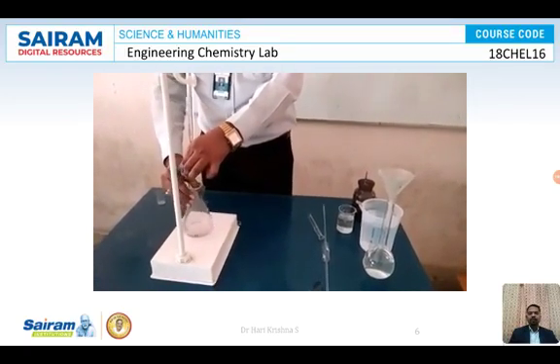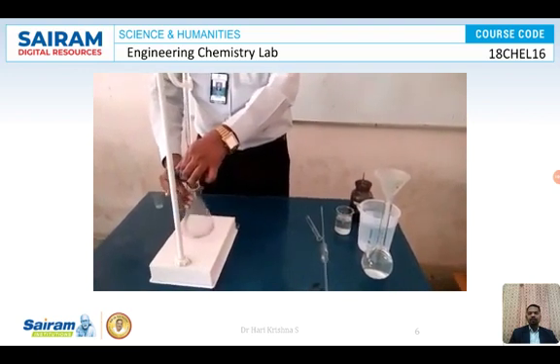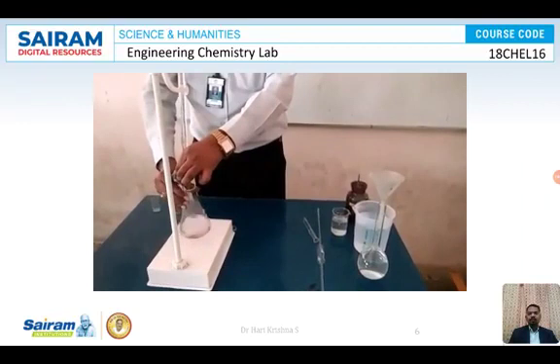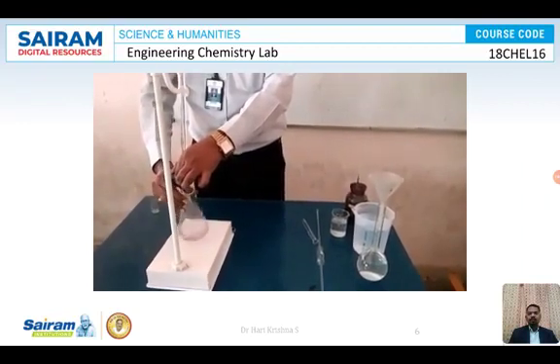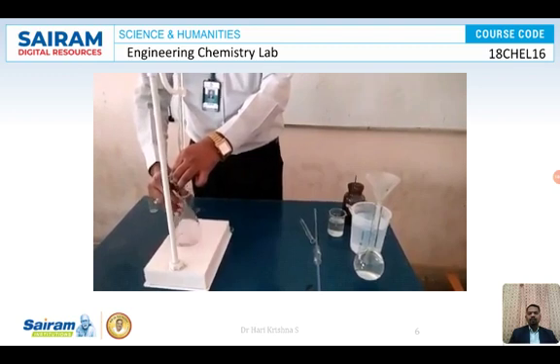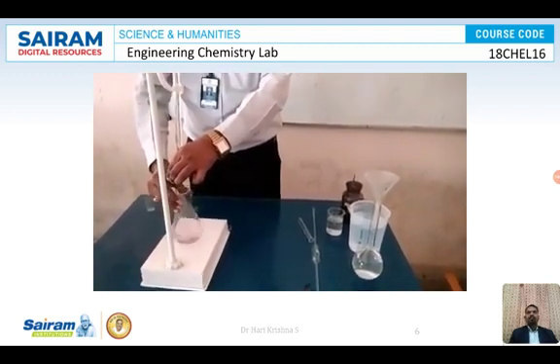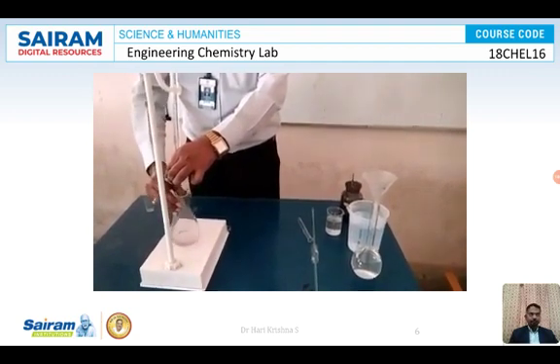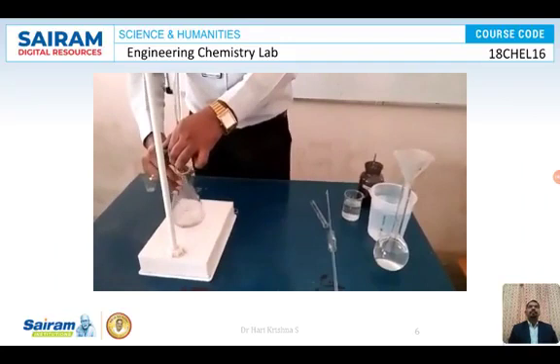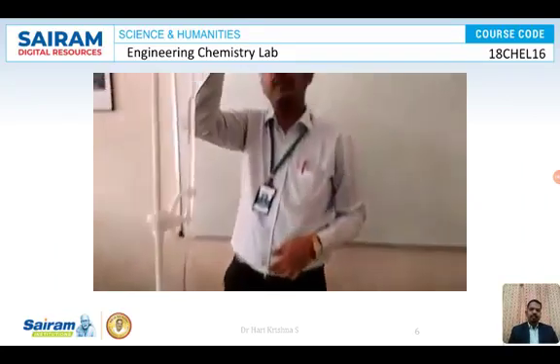You are supposed to control the knob with the left hand, and hold and shake the conical flask with the right hand. With continuous shaking and continuous addition, you will get the end point. So this light blue color is the end point.